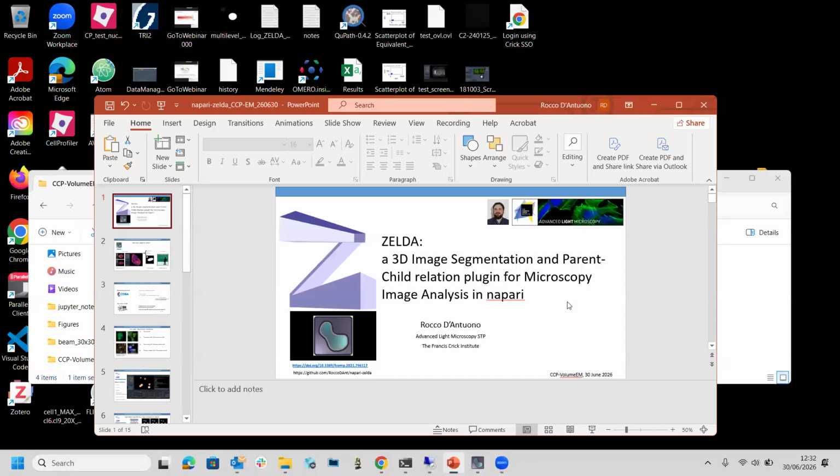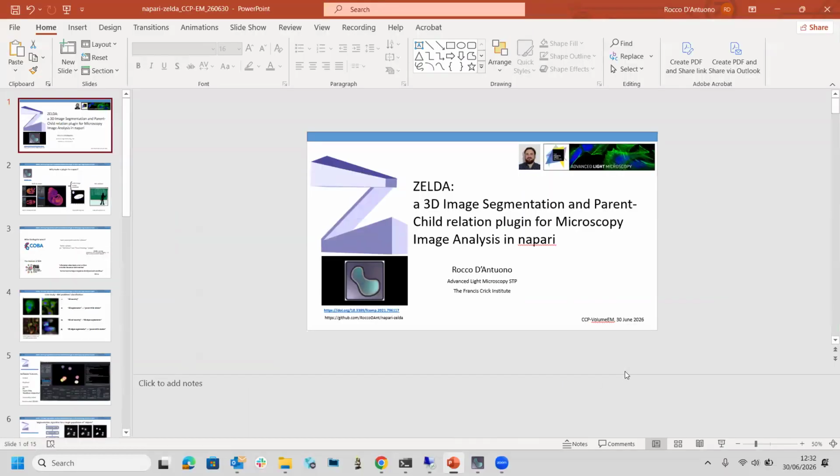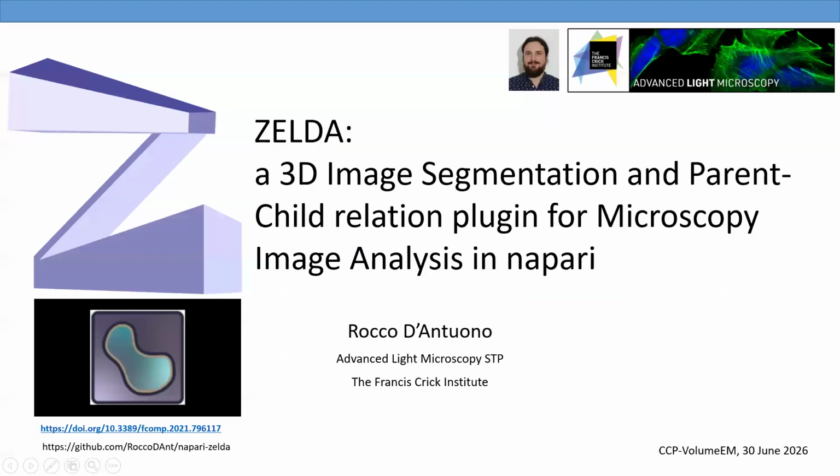Thank you very much, Ellen, and thank you very much for the community for having me here to present today. So I'll start sharing the screen and start with the presentation. So today I will present a plugin for Napari called napari-zelda, and then we will attempt a short live demo on how to use it. So I'm going in presentation mode. I hope slides are visible for Ellen and the rest of the audience. Yes, it looks good, Rocco. Okay, thank you.